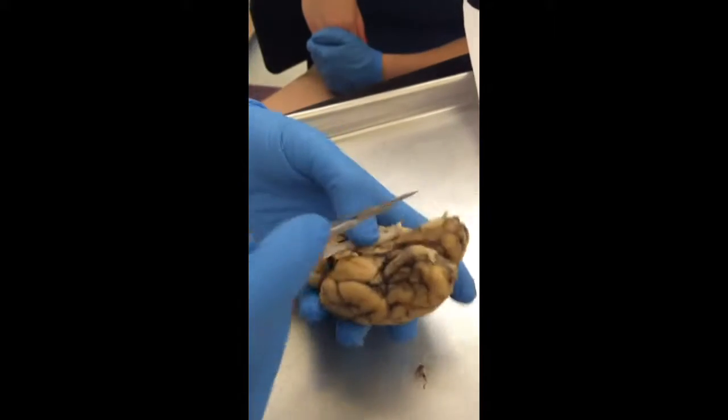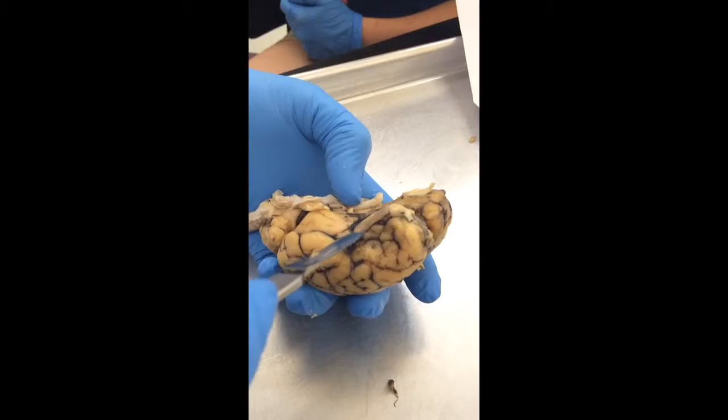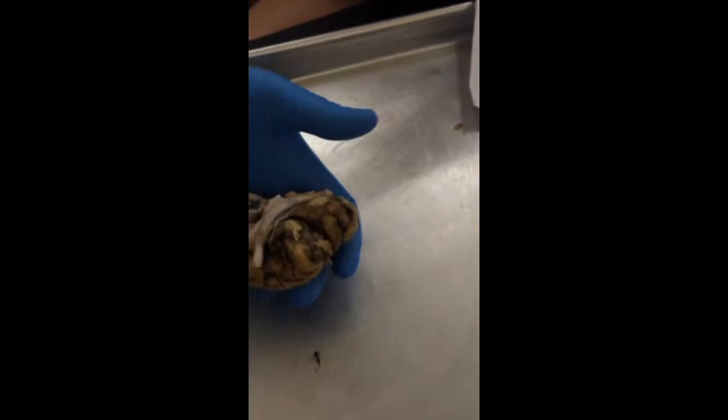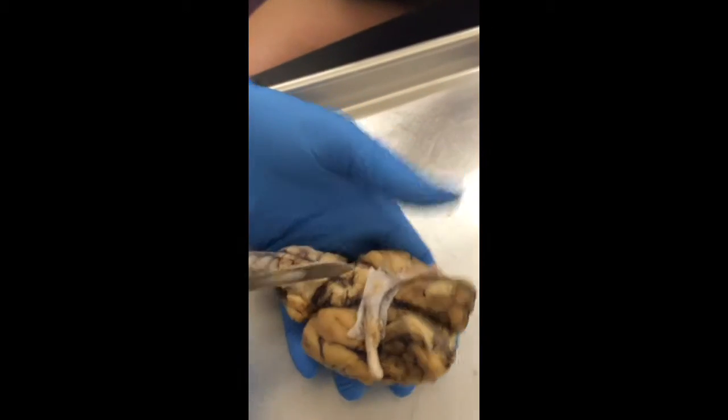So, the olfactory bulb is that right there. The olfactory tract is the tube leading out of it. This, like that, is your optic nerve. And where they cross is your optic chiasm.